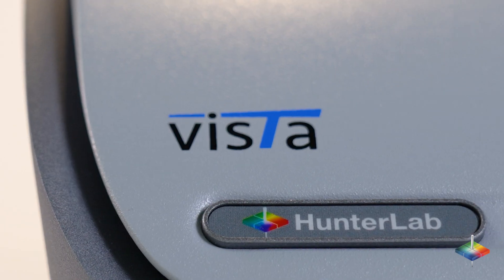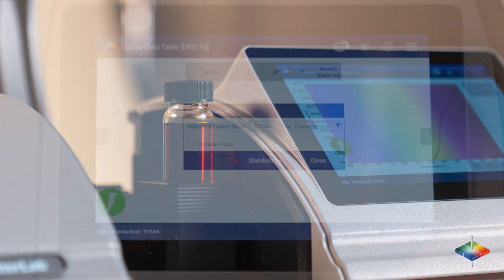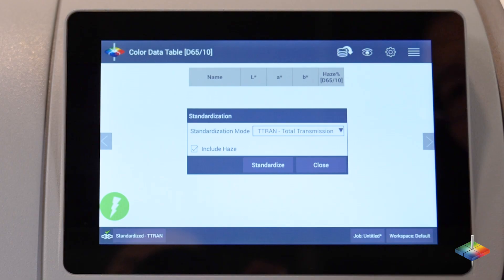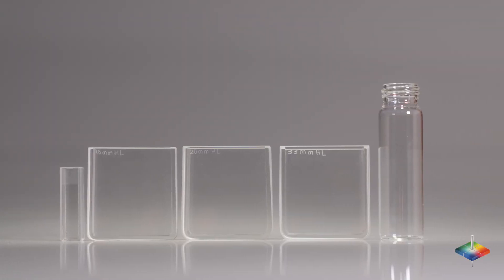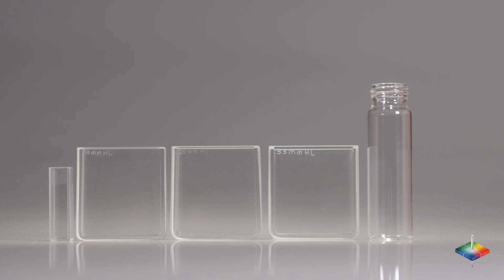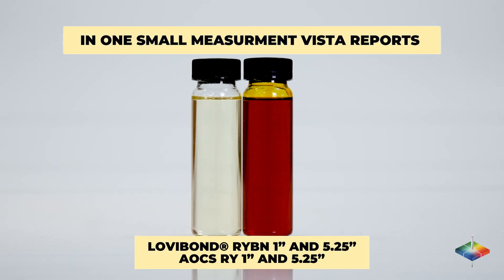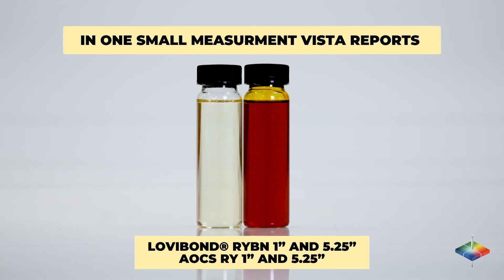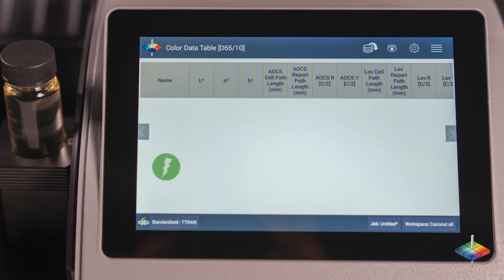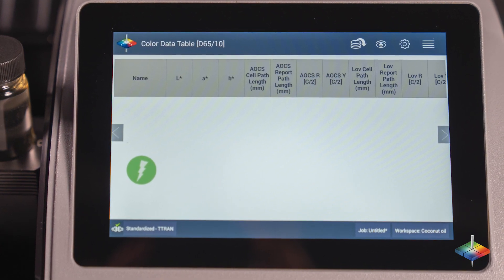Hunter Lab's Vista is the only instrument in the market that can measure color and haze or turbidity simultaneously. You can measure in any optical quality vial or cell as small as 10 millimeters. The Hunter Lab Vista spectrophotometer will accurately report Lovibond RYBN 1 inch and 5.25 inches results, as well as AOCS RY 1 inch and 5.25 inches results, all in one test.